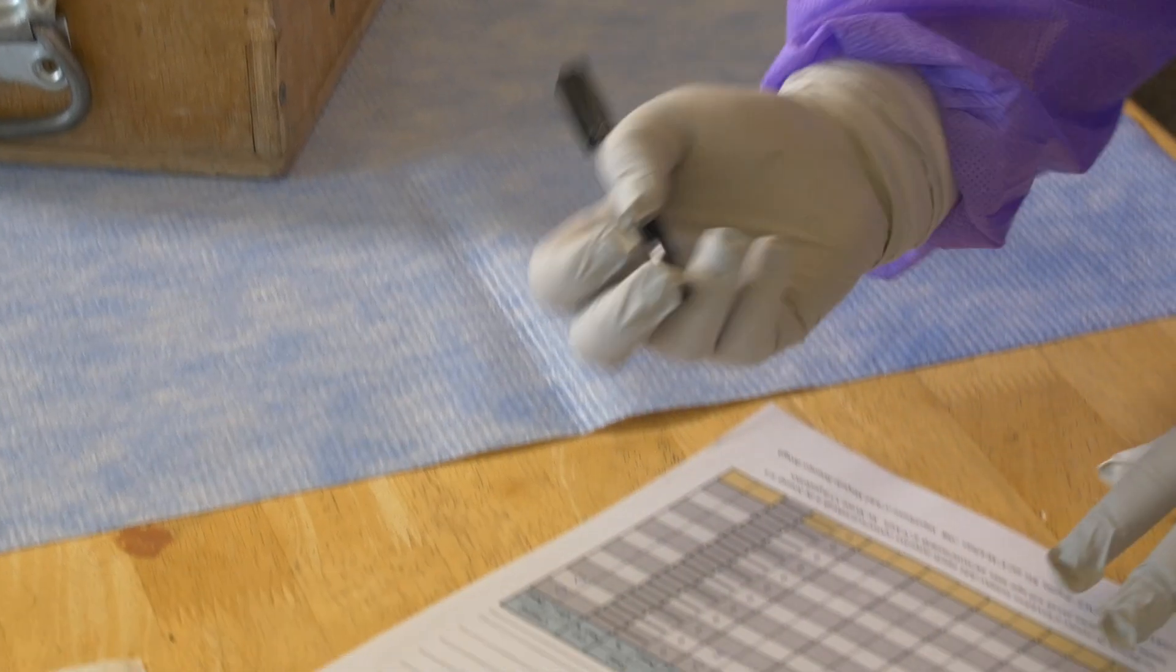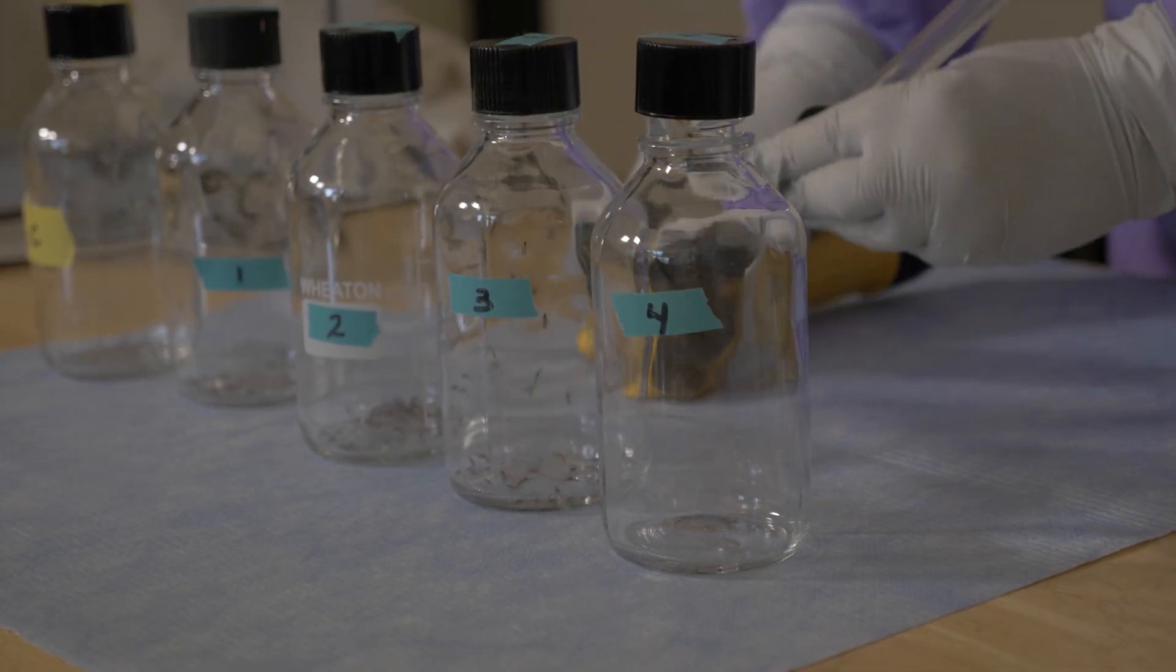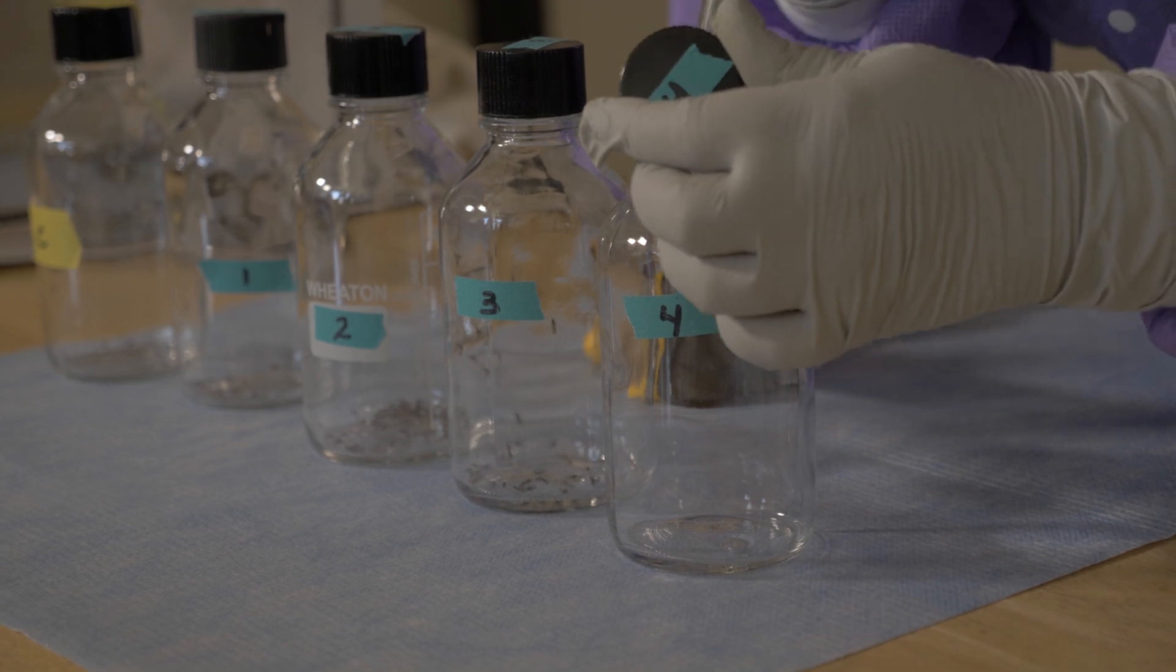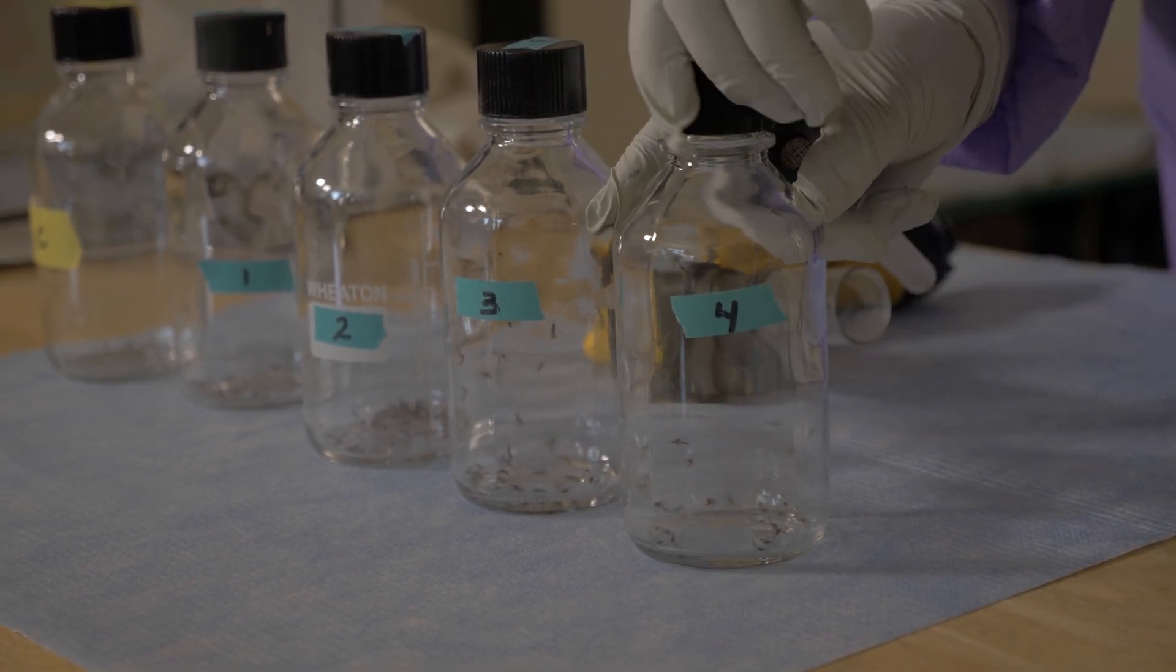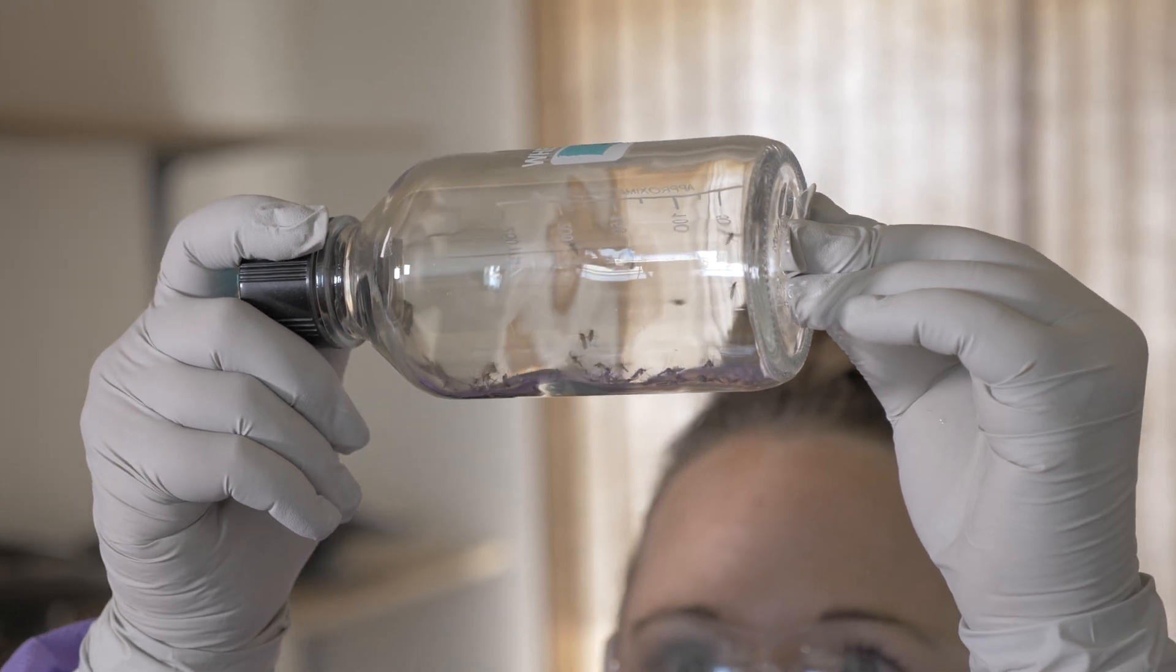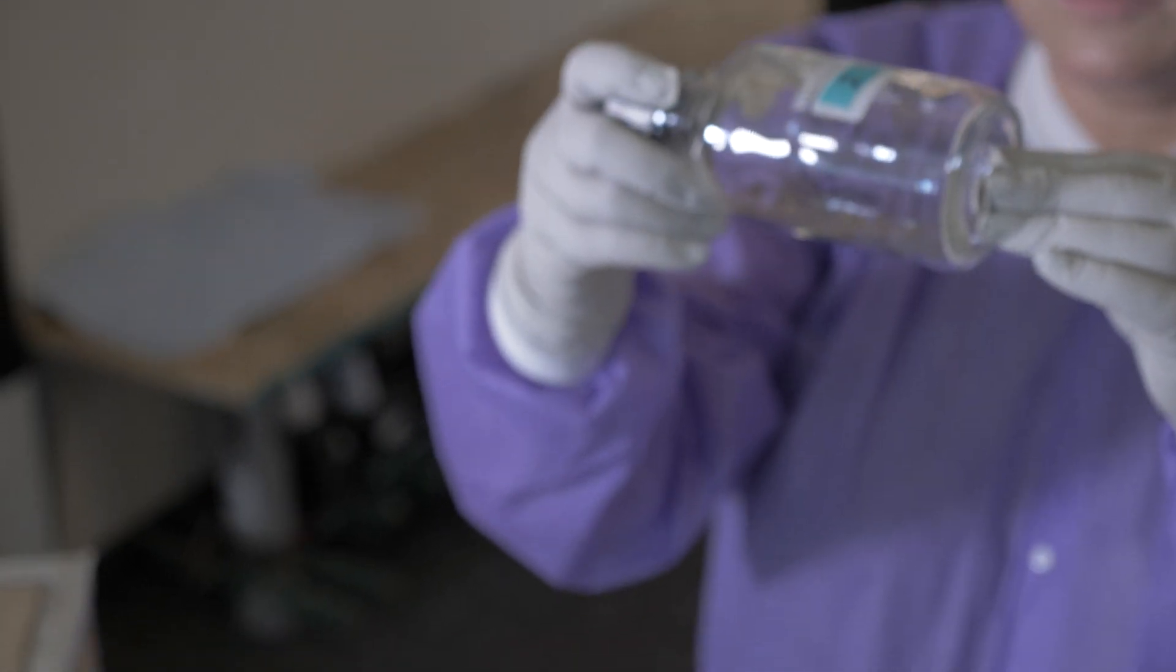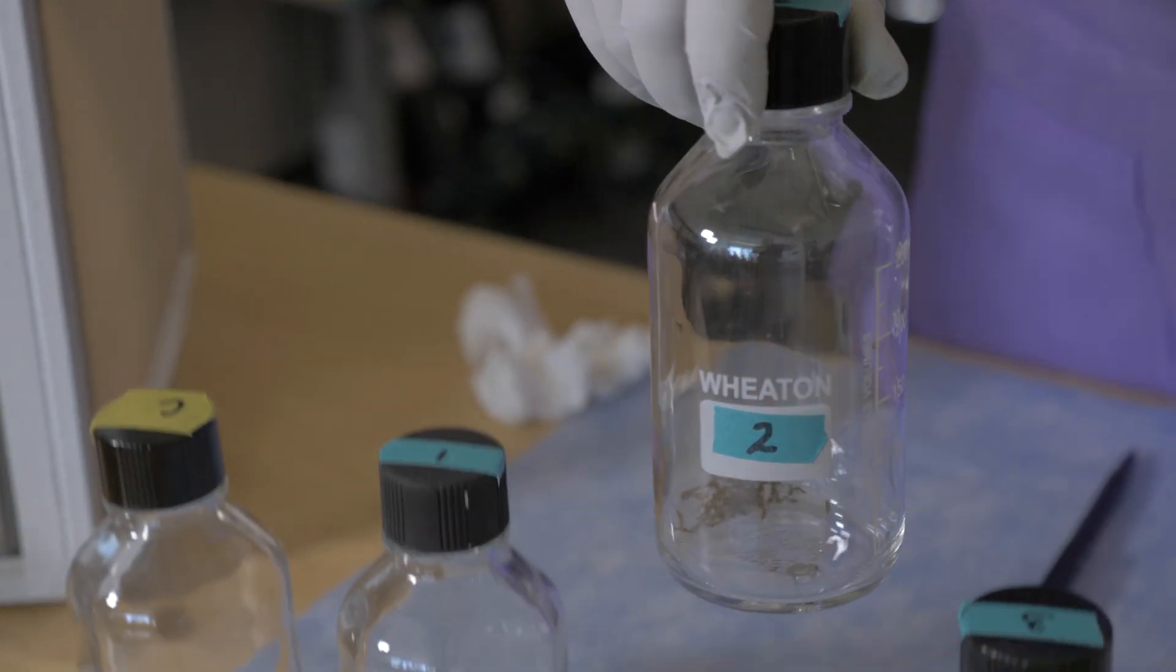CDC has developed a test, or assay, to determine if a particular active ingredient in an insecticide is able to kill mosquitoes. In particular, it detects changes in the time it takes an insecticide to kill a mosquito. The technique, referred to as the CDC Bottle Bioassay, is simple, fast, and cost-effective compared with alternatives.